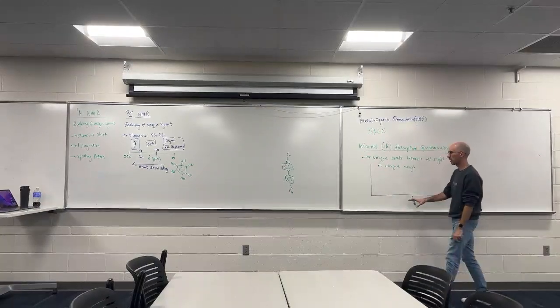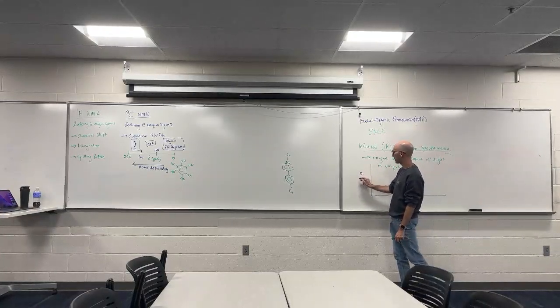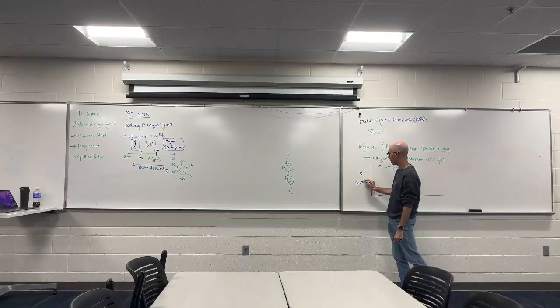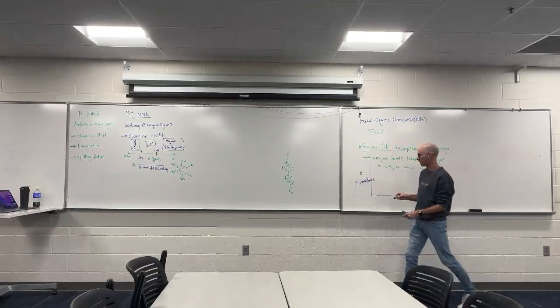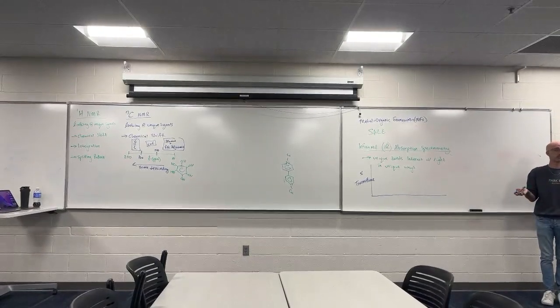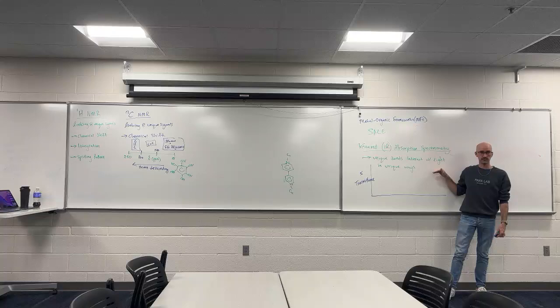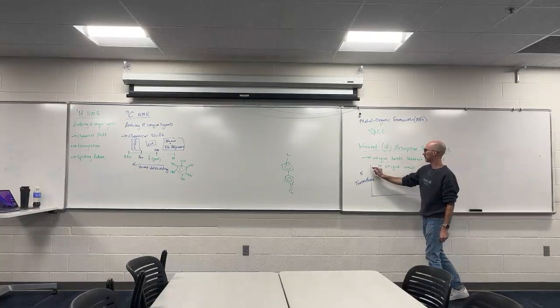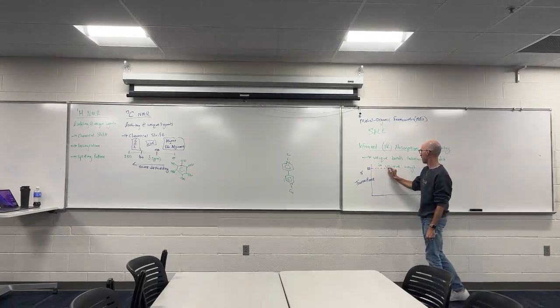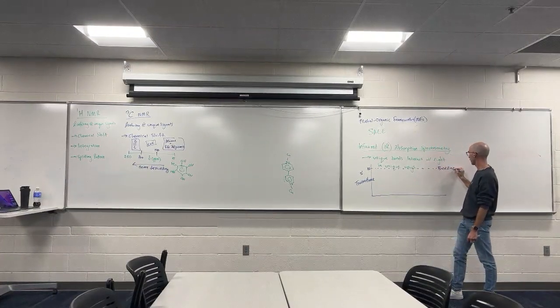We're going to look here at our IR spectrum. On the y-axis, we're plotting percent transmittance. That is, in my instrument, I'm shining a certain amount of light towards my sample. At the top, 100% of that light is coming through. This is basically our baseline. No light absorbed.